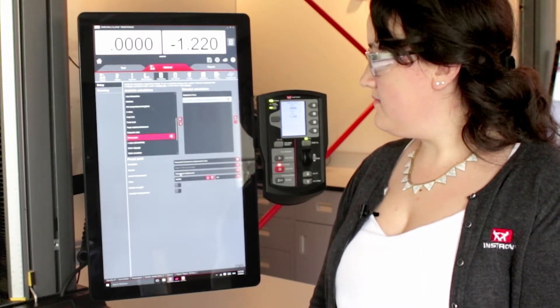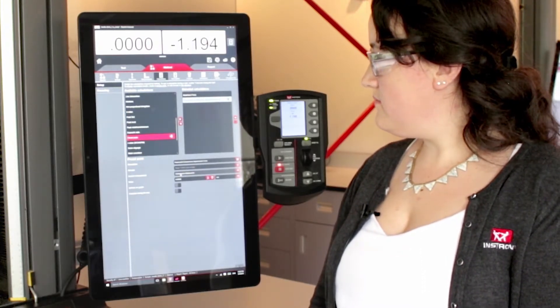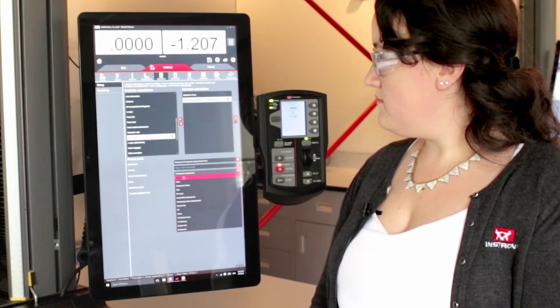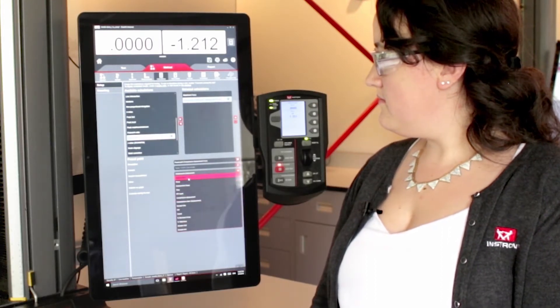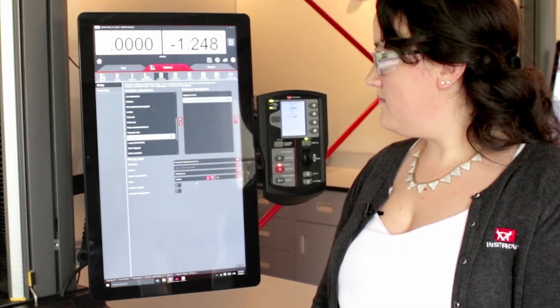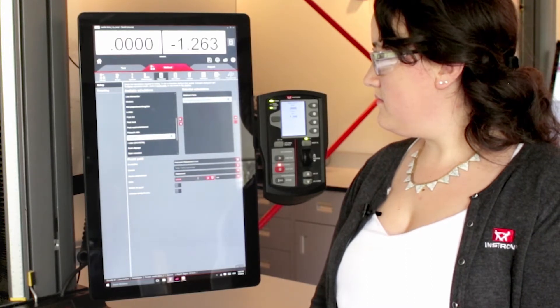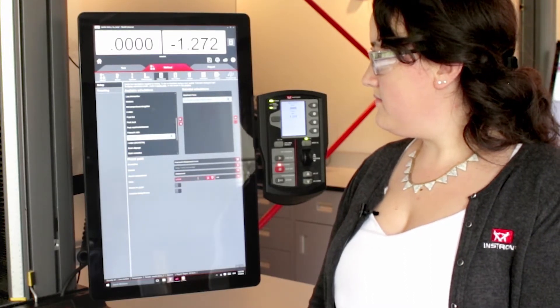Our source measurement, we're going to set up as displacement, compressive displacement. And our value we're going to put in as five millimeters.